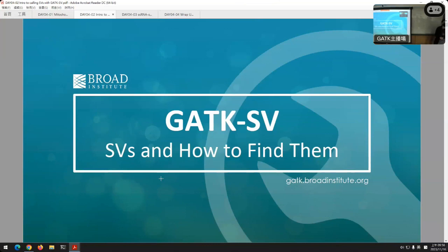All right. Well, this is the moment that I've been waiting for, because I work on structural variants, and now I get to talk about structural variants. This is the very first time that we've presented this session, so that's exciting for me. I will be talking about our pipeline for characterizing structural variants from short-read whole genome sequencing data. And that pipeline is called GATK-SV.